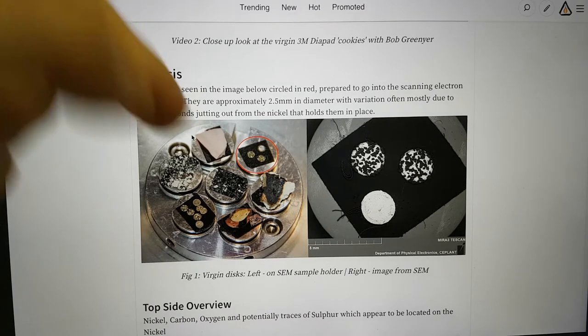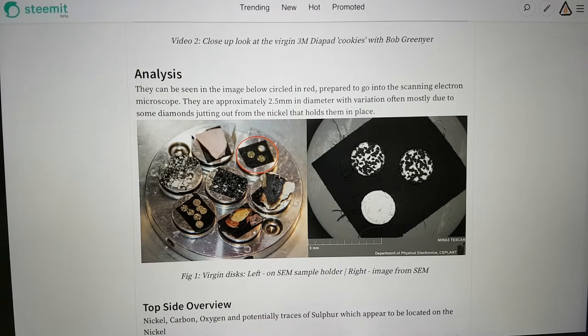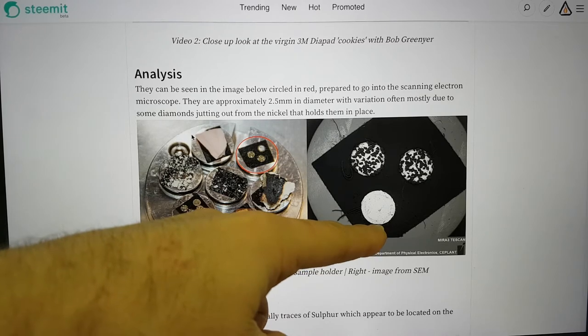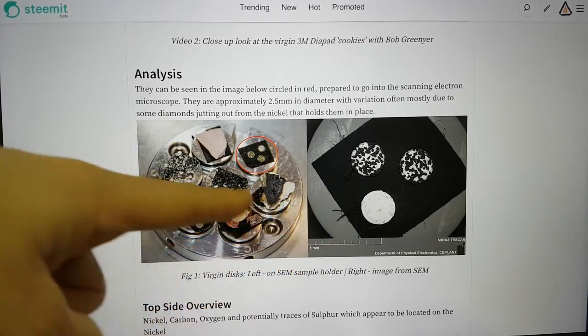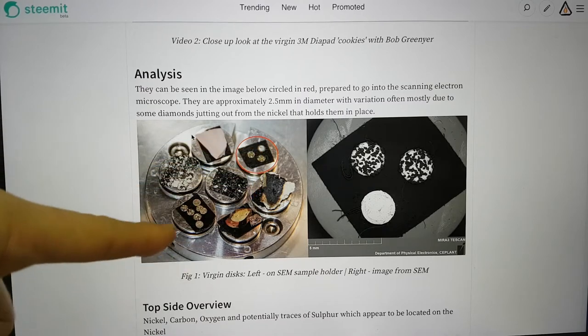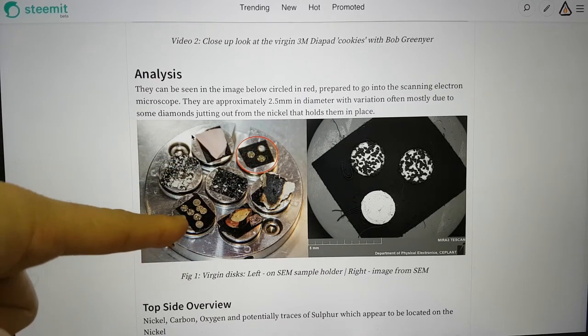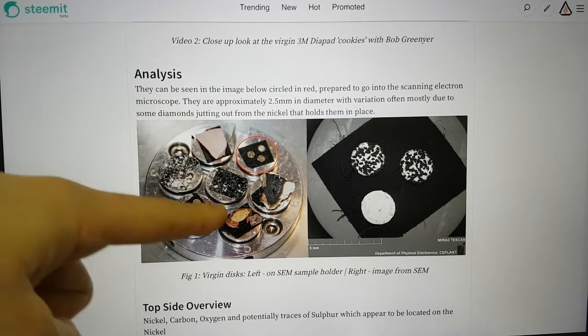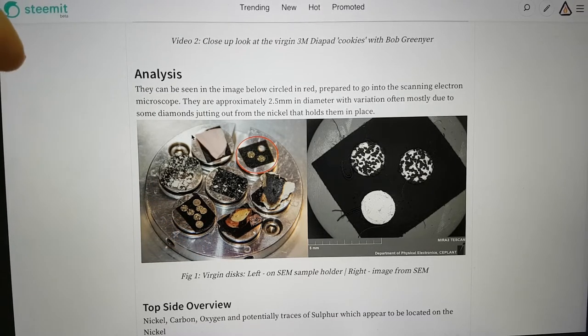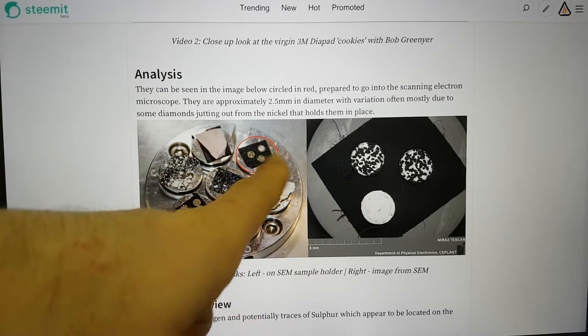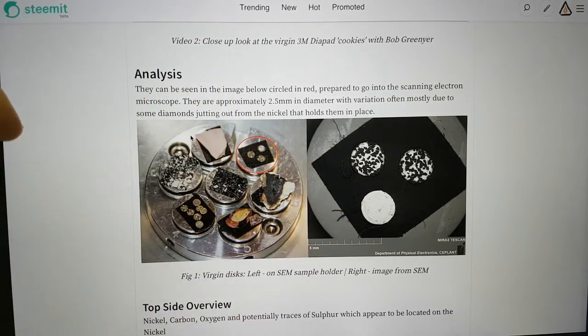Two on the cut side and one on the back side. The SEM is of the unused diamonds and nickel discs and this is a sample of those that ran in the Lion 2 reactor. This is what the unused discs look like in the SEM.